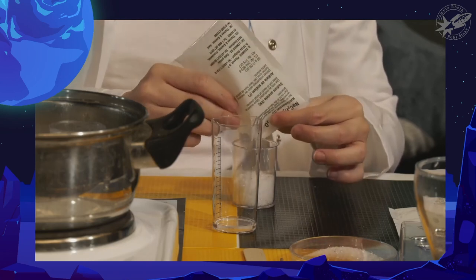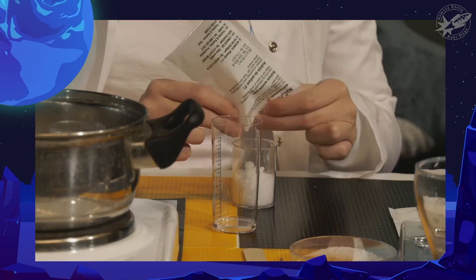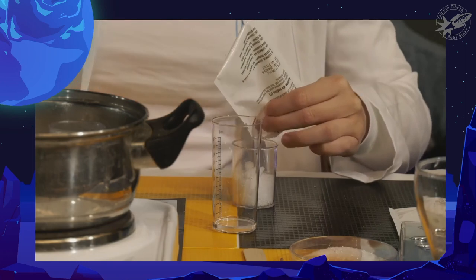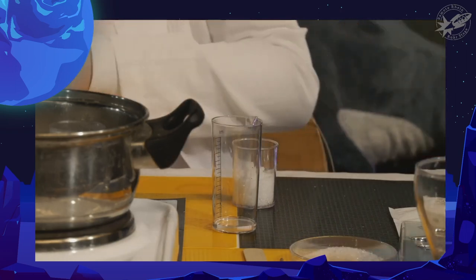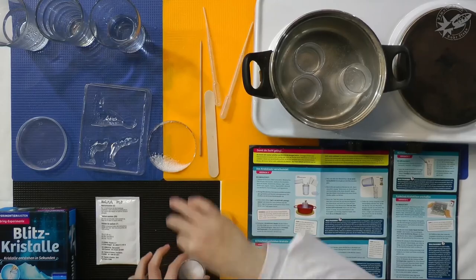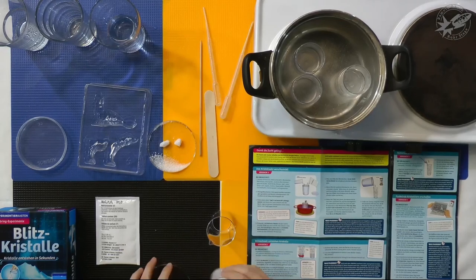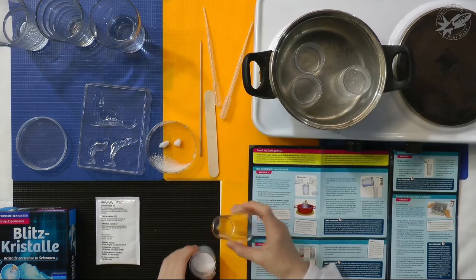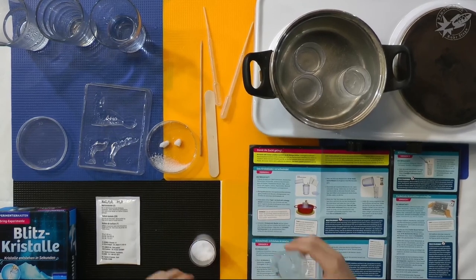I'll pour the first one. Here, the manual is missing that I should remove the crystals and put them in a petri dish. Now the package is empty. Therefore, I'm going to open my petri dish and take out the two biggest ones. The crystals themselves are rather like sugar, like you might know from normal household sugar.